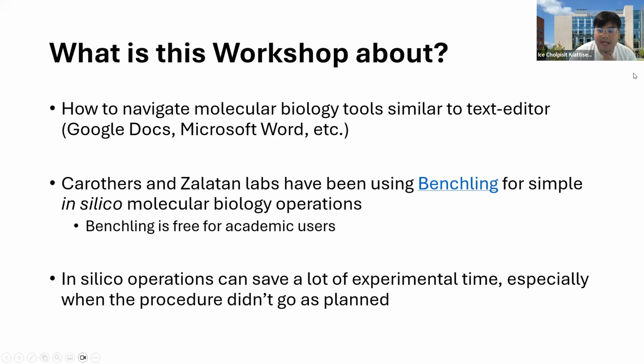The idea behind this workshop is that when anyone comes to molecular biology or synthetic biology in general, you have to work with molecular biology tools that are similar to a text editor. When you're taking notes or writing a document, you may use Google Docs or Microsoft Word.